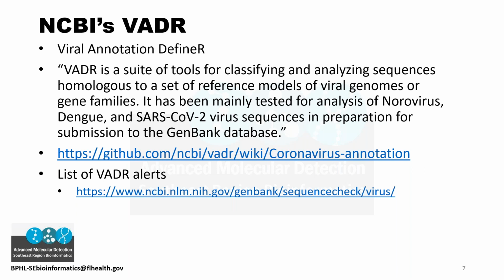How can you confirm whether a mutation is real or not, or whether it's a sequencing error? We'll go over all of that in Part 5. There's just a little bit more information involved with that.